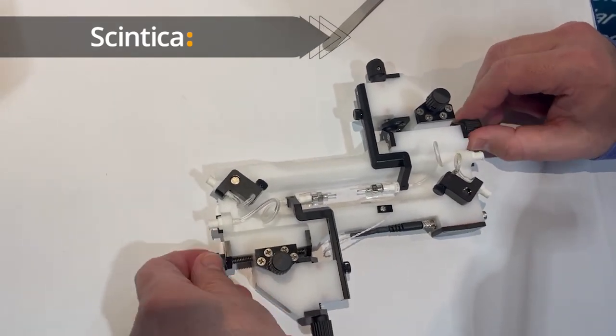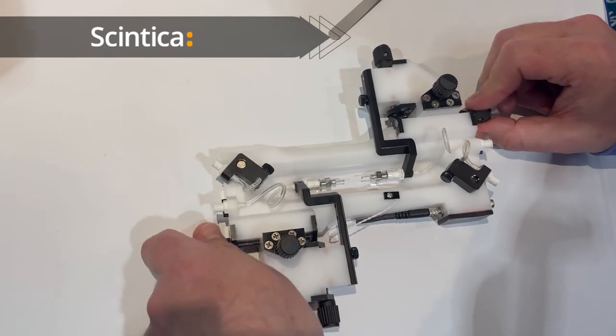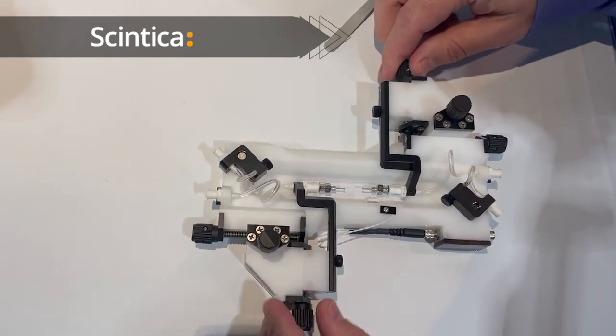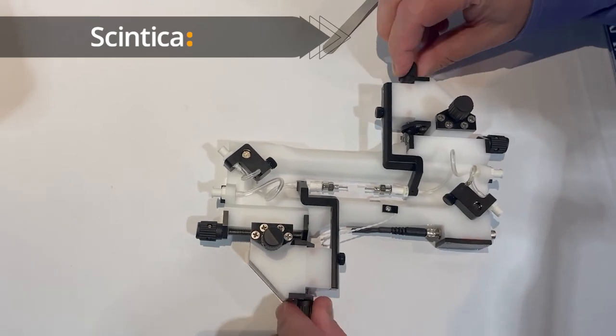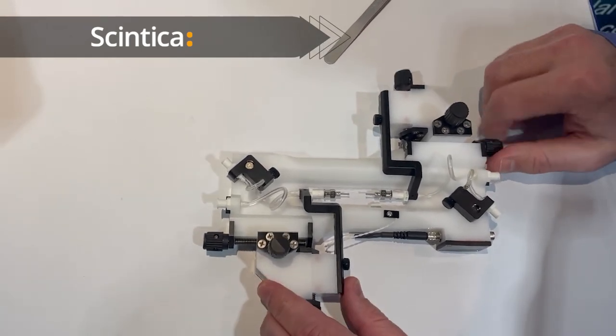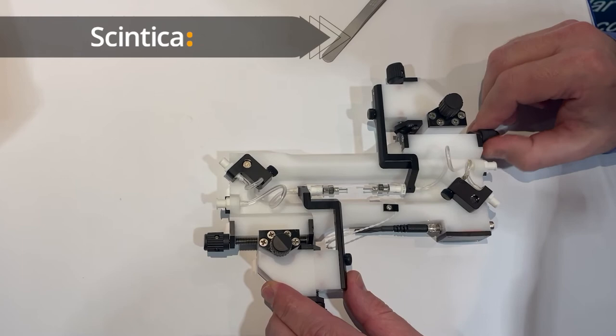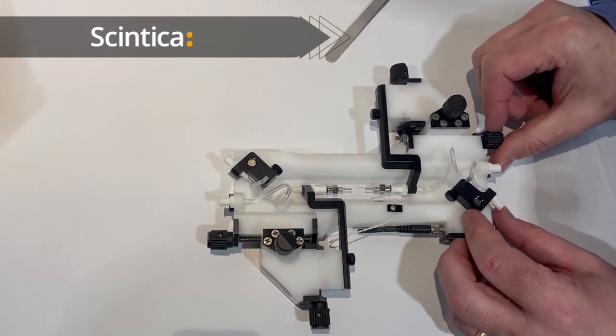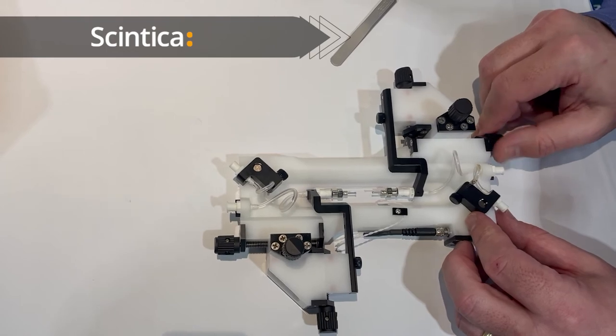Cannula alignment is also very easy using three-axis positioning manipulators so you can just turn these positioning screws to align the cannula in all three axes, bringing them closer together for mounting the preparation and then lengthening them apart to achieve the desired stretch on the vessel.